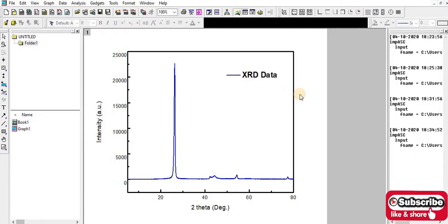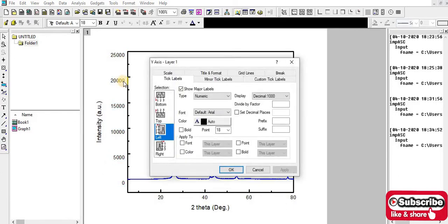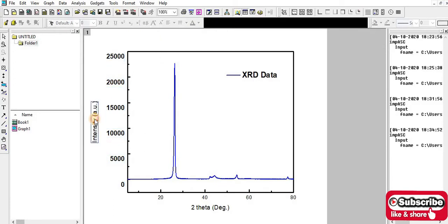So if I want to change this font size, I have to select it. If I want to make it bold, then bold. And I'm going to select 24, okay. And this font also, if I want to change, this is default, but in this case I can change to 28. Okay, if I want to make bold, bold is not active here, but okay, you have to write. Make it bold, yes, bold.